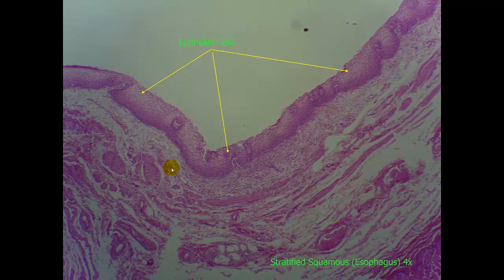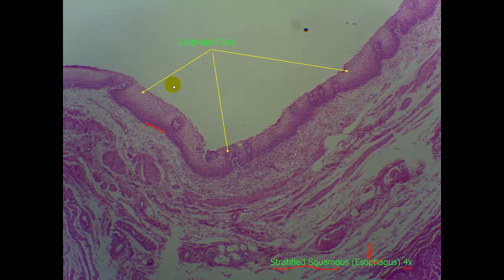The first slide we want to look at is stratified squamous. Please notice that I have the name of the tissue here at the bottom with where it's found along with the objective-only magnification. These are stratified squamous epithelial cells as indicated by these yellow arrows, from here to there. At this edge, we will have the basal membrane or the membrane that will connect it to the connective tissue underneath, and on this side, it is the apical side — the free edge of this stratified layer.